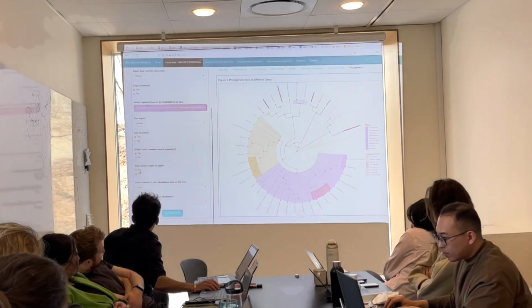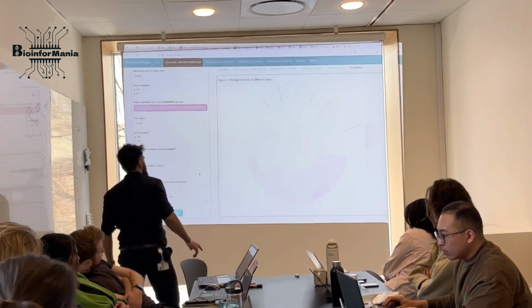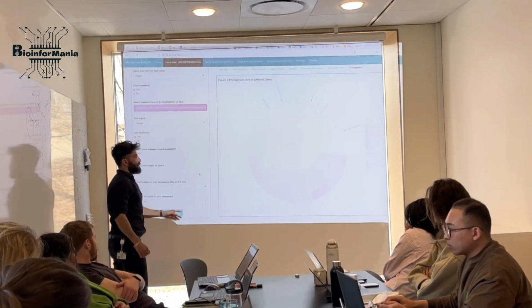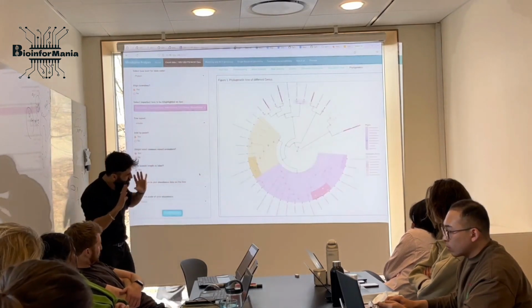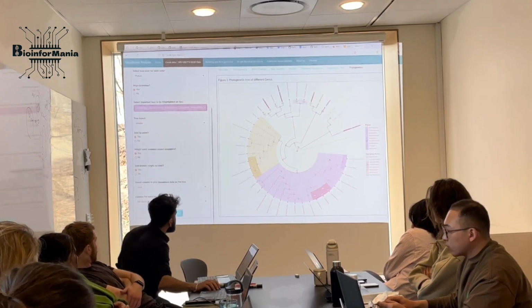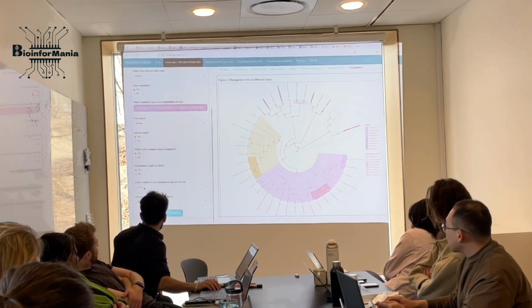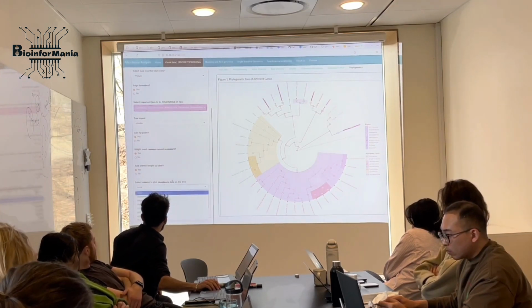What else could you do here? Branch length. This is a little bit computationally expensive because it's using a bootstrap to calculate this distance, okay? But voila, you have it here. Sadly, it's not responsive. I couldn't figure out how to do that. So oh yeah, here, this one.